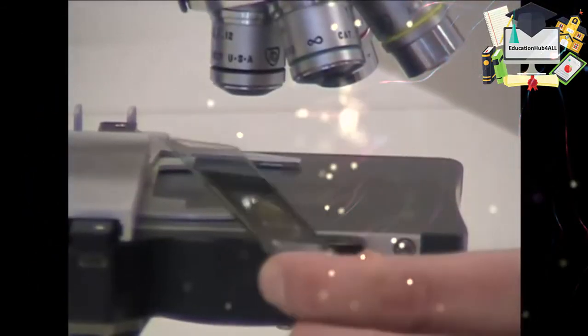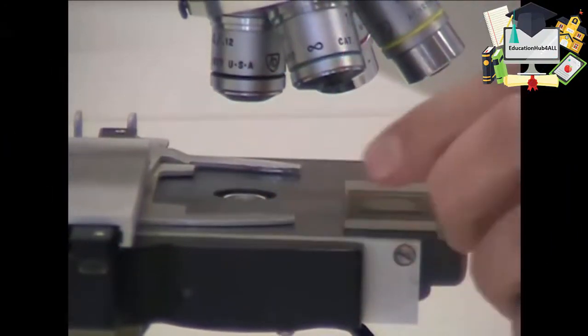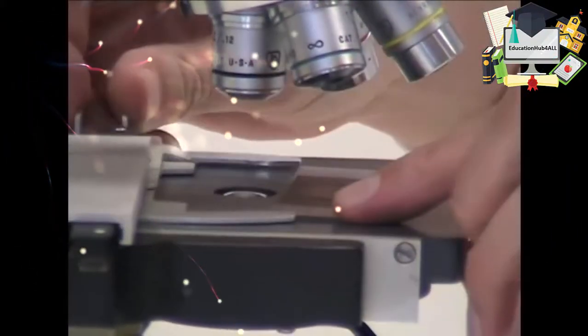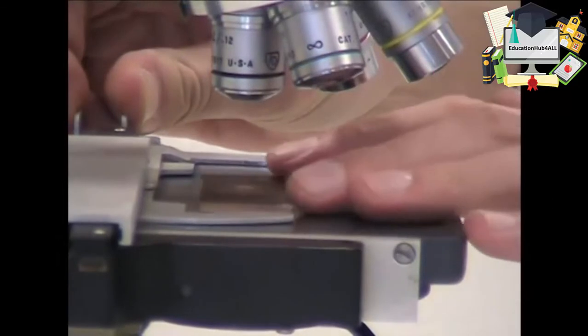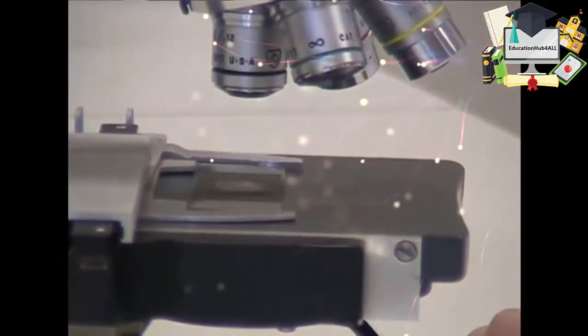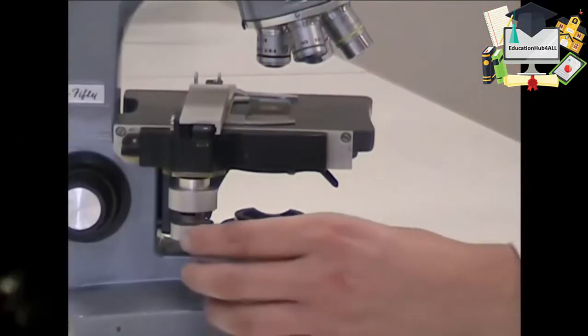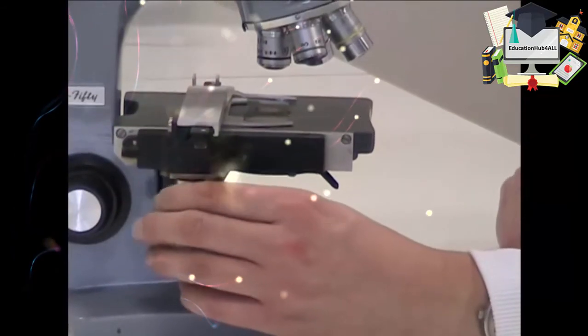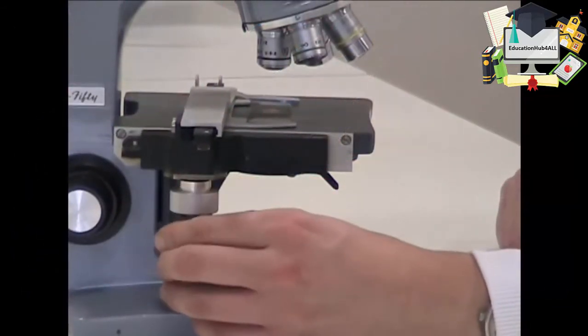Here's a prepared slide that we're going to look at. Put it on the stage of the microscope and clip it in place like so. To move the slide around the stage you can use the stage controls like this.